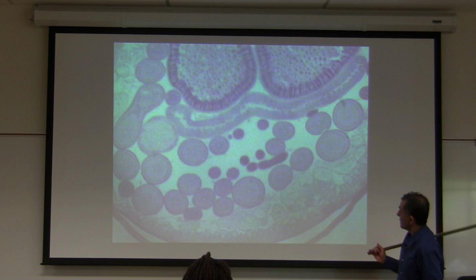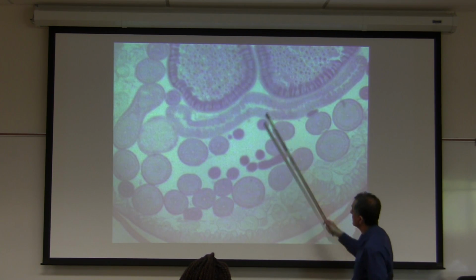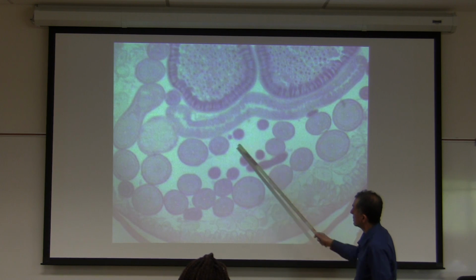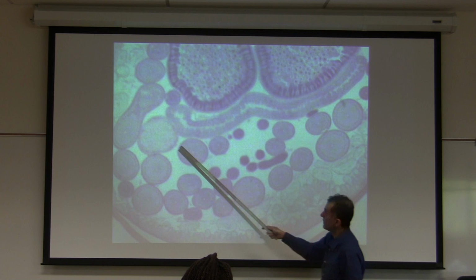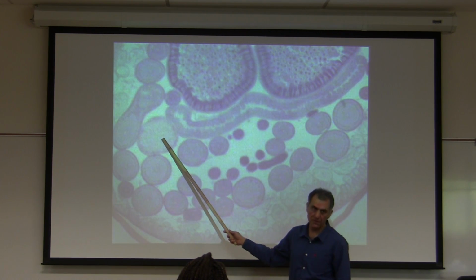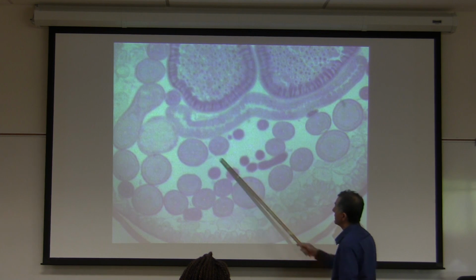Okay, determine the gender. Female. What is the name of structure? Uterus. What is the name of structure? Ovary. These are all ovary. All of these guys are ovary. What is the name of that structure? Oviduct. Okay, so all of these are ovary, and this is oviduct.